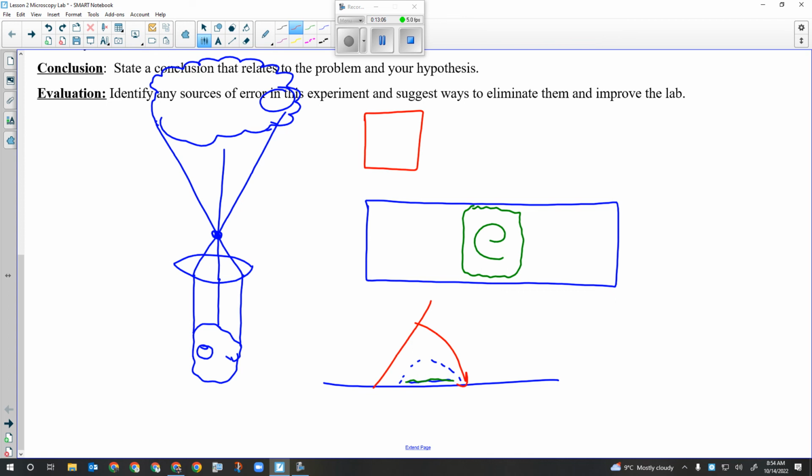That's the whole reason we use the water, right? If we just set that on there with just the letter E, is there anything that's going to hold it all on? No, and even your breathing while you're looking through the microscope will cause it all to fly off. So the water is there in order to make this a true wet mount and keep everything in place. So that'll just fall down, it'll squish to the sides, you've got your wet mount, and you stick it in the microscope. Now, here's the key.